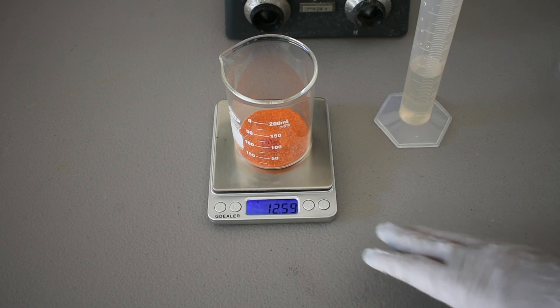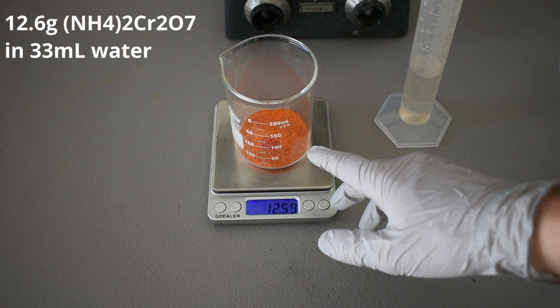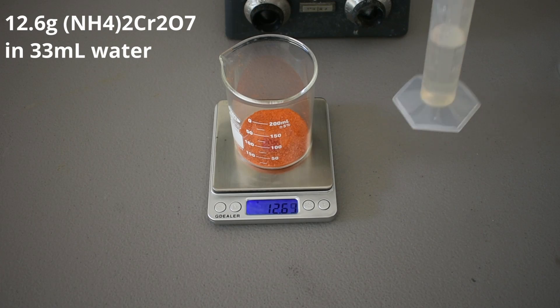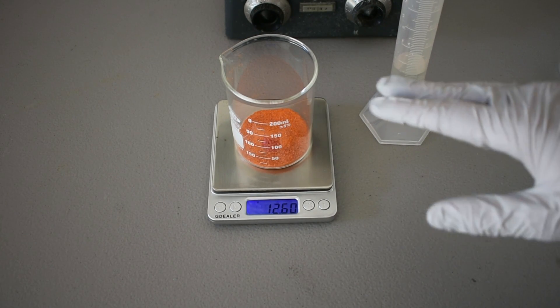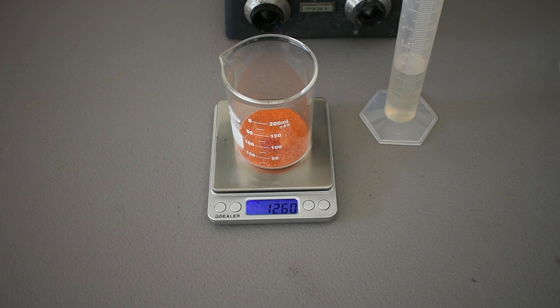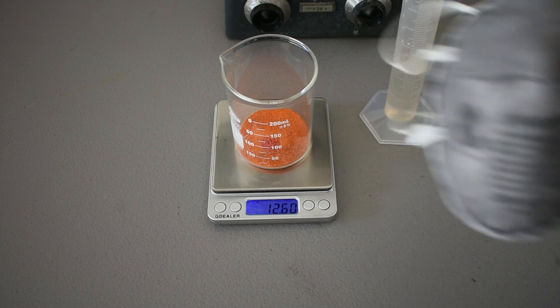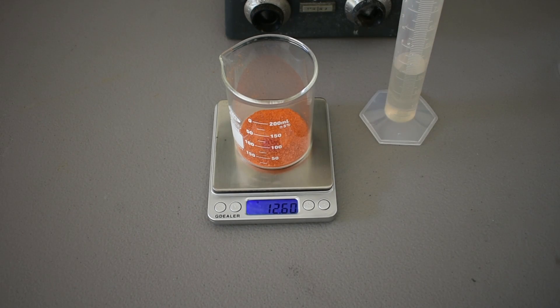Alright, so I've weighed out about 12.6 grams of the ammonium dichromate, and we're going to dissolve that in about 33 milliliters of water. And make sure you're careful when you're pouring the dichromate. You really don't want to be inhaling that dust, so make sure you're wearing a mask. It is a proven carcinogen, of course.